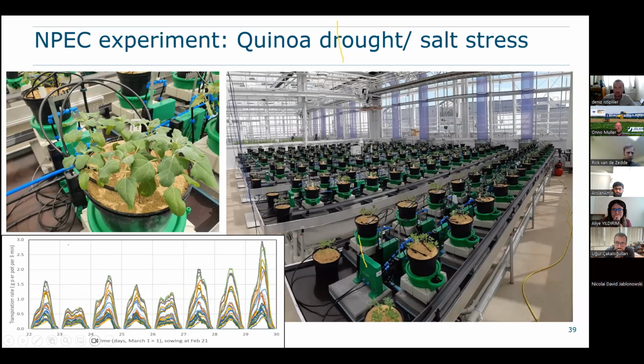And you can also profile this water uptake behavior and compare them with each other. And in that way, objectively judge how these root systems interact with the soil and the available water. So it's not root phenotyping, but it's actually all driven by the root system.